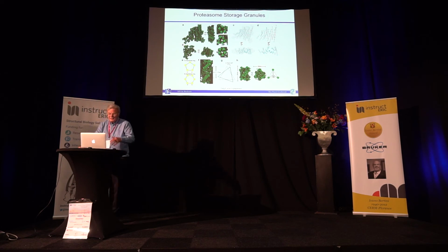Now, these trimers are then exported, and we can directly visualize that through the nuclear pore complex, and they go into the proteasome storage granules. These granules are initially in a completely liquid state, but then after 3 or 4 days they begin to solidify. What we observe is that the trimers assemble into fibrils, and these fibrils associate further, forming paracrystals. The irony is that for many years people have tried to crystallize 26S proteasomes without any result. But here, I think we see at least the beginning of crystallization in vivo.